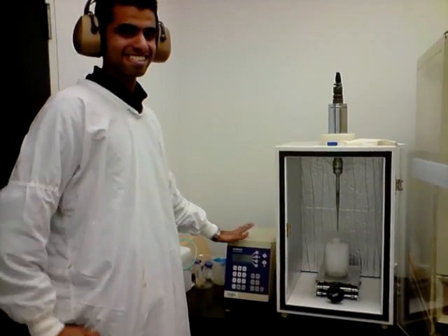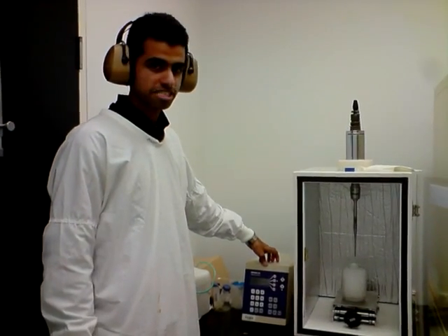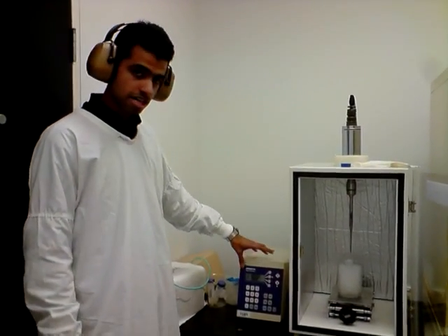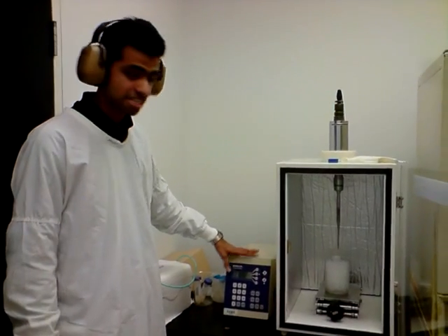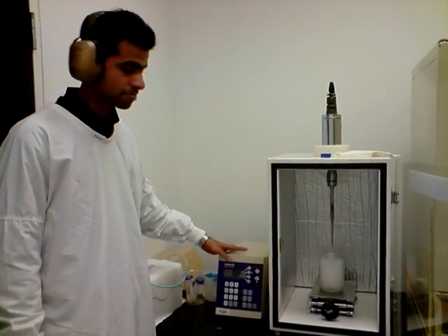Hi everybody, this is the sonicator equipment that we will be using to lyse the cells. As you can see here, this is the control interface where we set the amplitude and the time at which it will run and the time it will stop.